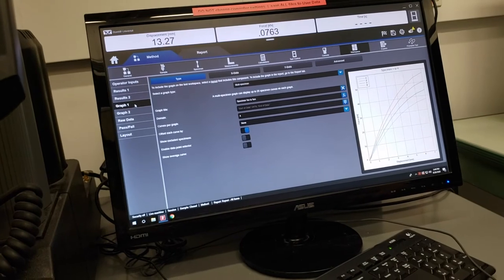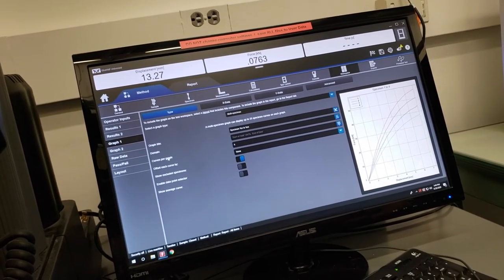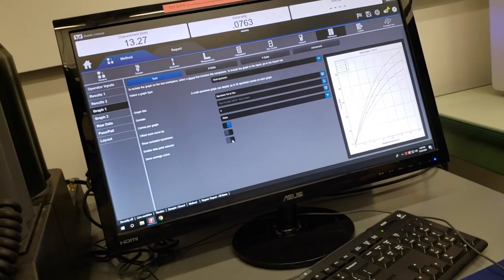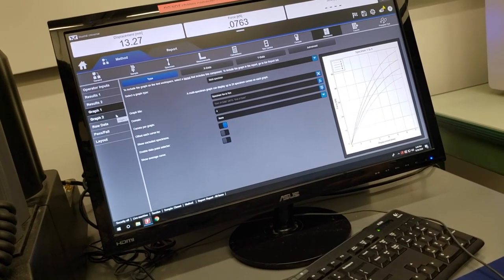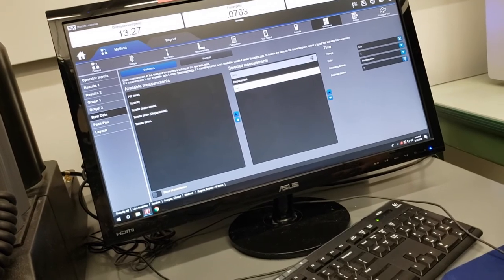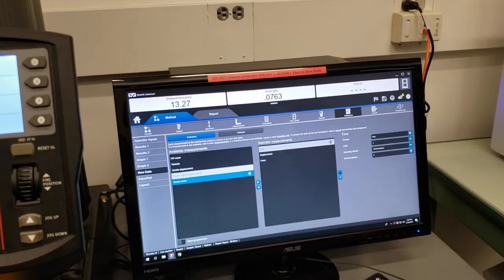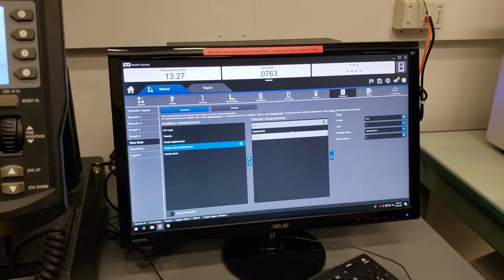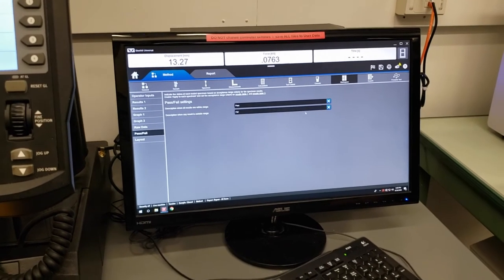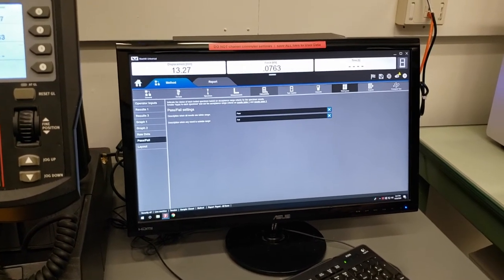Next is graph — a graphical representation of the data. You can choose X and Y data, number of curves per graph, graph title, and whether to show an average across specimens. You can have two different graphs as well. Raw data by default is time, displacement, and force. If you have correct sample geometry and information in the software, it can also calculate stress and strain for export. Pass or fail settings allow you to set pass and fail criteria, most useful in a quality control setting. For more information on this, click the question mark.